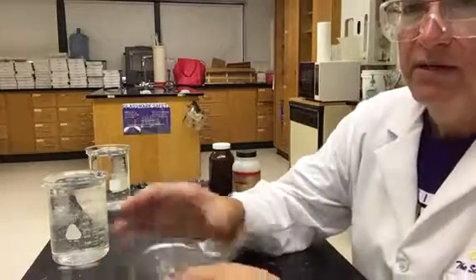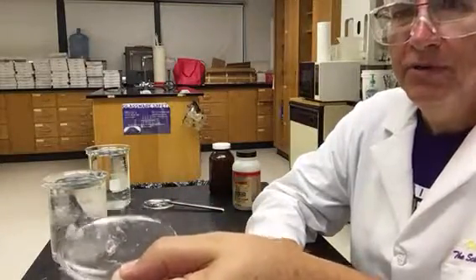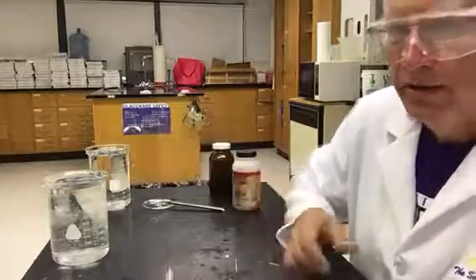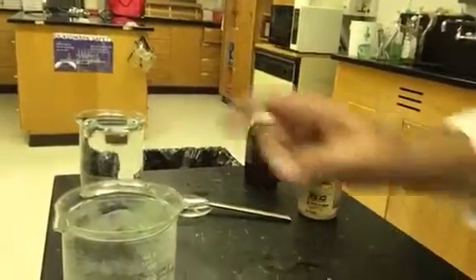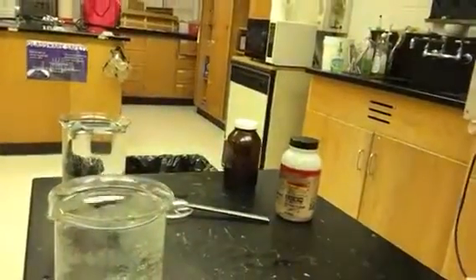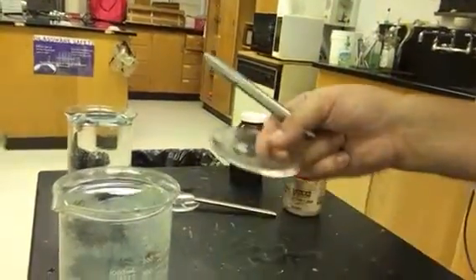still on my Petri, on my watch glass, and I'm going to put this small piece of sodium in some water, and let's observe what happens. So here is just plain old water. I'm going to take my sodium now and put it on top.